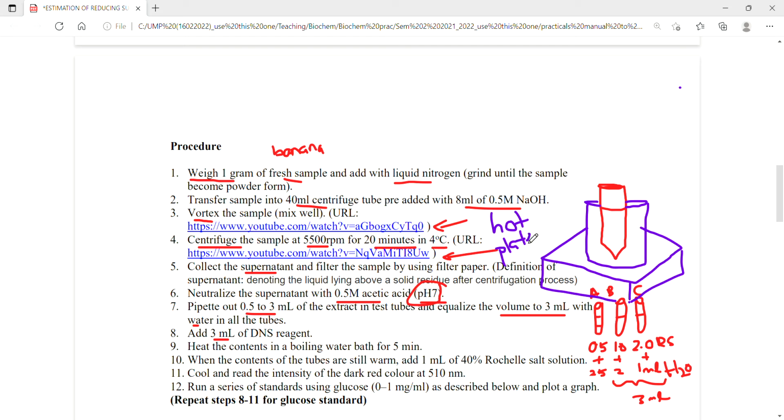Right, hot plate, and here I pour water outside of it, and our supernatant is inside. Or rather these tubes are inside there. Maybe I put A here, and then B and C.